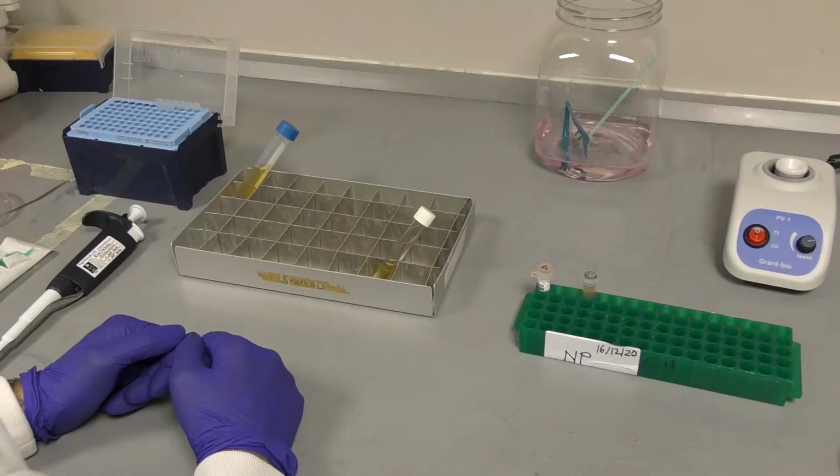In this video, we're going to talk about how to set up a primary culture from your STGG specimen vial 5 that you pre-aliquoted in a previous video. We will then go on to discuss setting up rectal primary culture plates from the vial 1 Cary-Blair aliquot that you also set up previously.